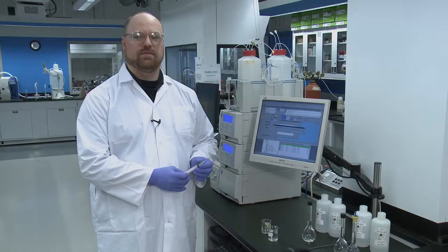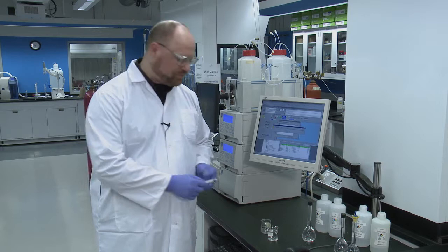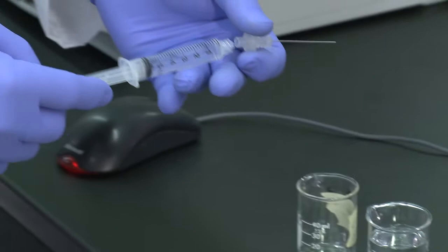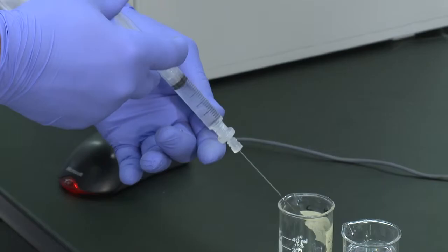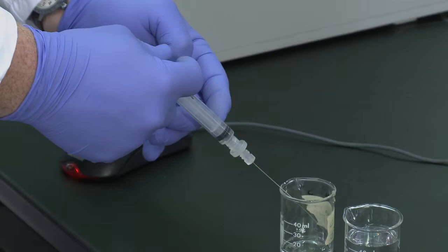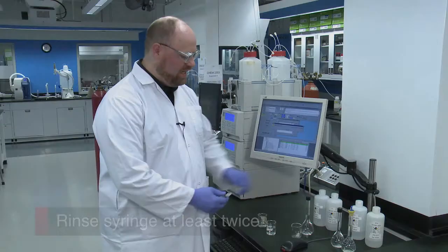This syringe has a filter on it that needs to be removed when you're filling the syringe. So you take the filter off, you're going to drop liquid, in this case we're just using water to rinse the syringe, put the filter back on, and expel it to waste through the filter. We're using deionized water for rinsing the syringe. It's going to take a little bit of effort to do because the filter does restrict the flow. You're going to want to do this a couple of three times.